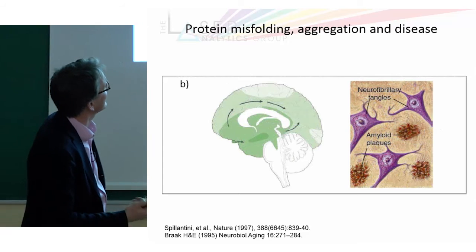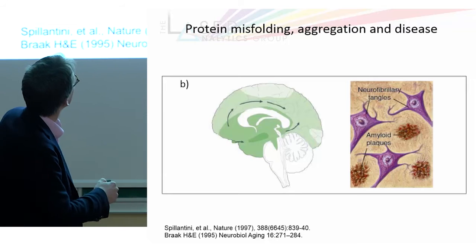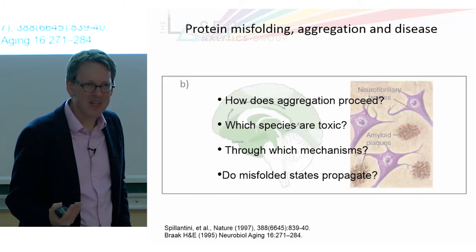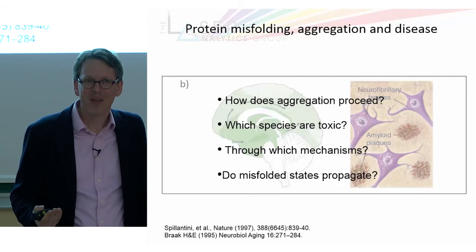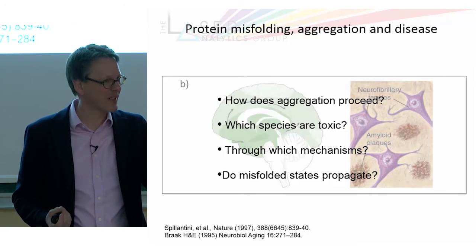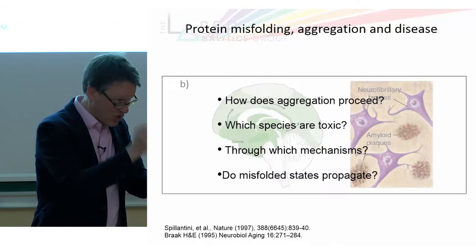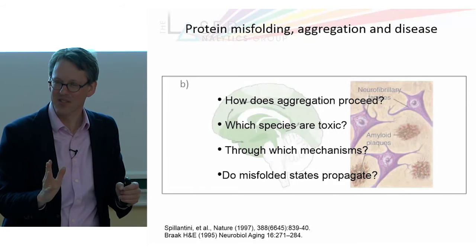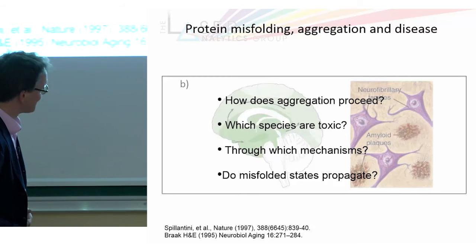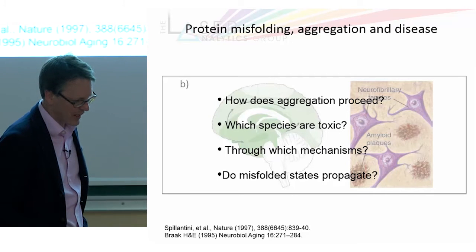Some of the questions we would like to know are, where do these species originate? How do they transport through the brain? Are they becoming infective to other proteins inside the cell? And of course, if you want to study this process inside cells, then you want to do this with optical techniques, because with optical techniques, we can be very selective. By using special molecular labels, we can just target the proteins we're interested in, not the others. And we can look inside the environment where these species are formed. So these are some of the research questions that we would like to address.